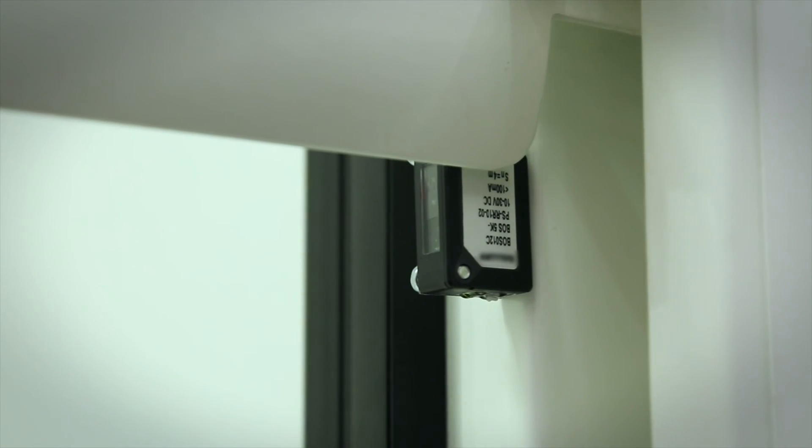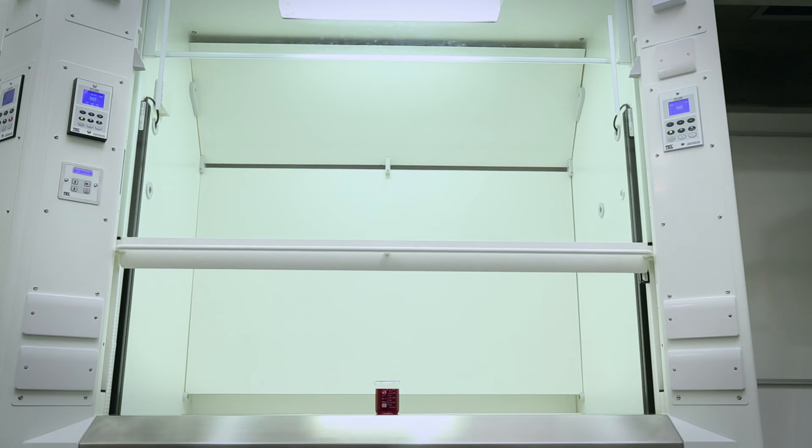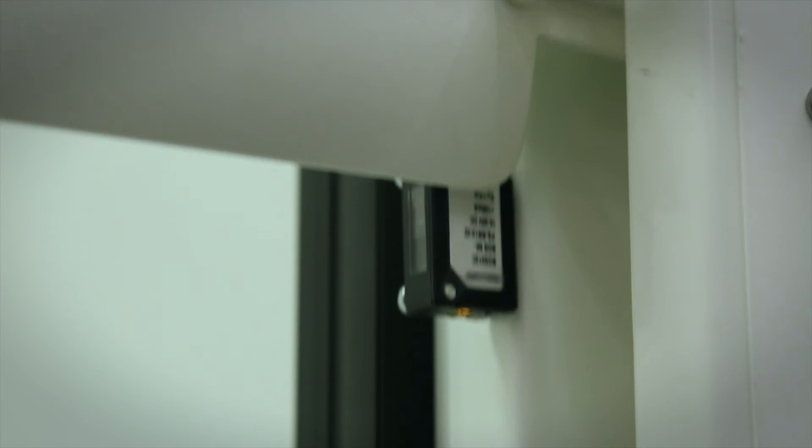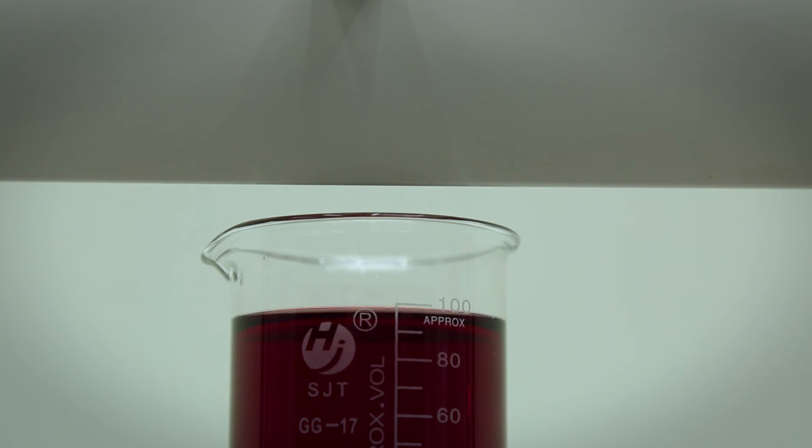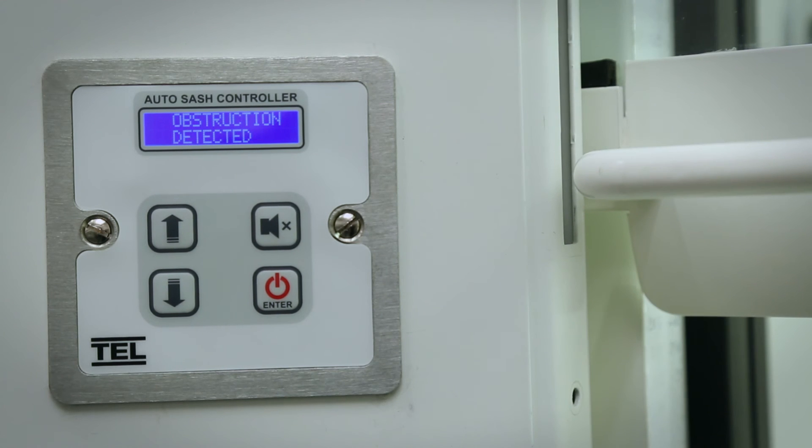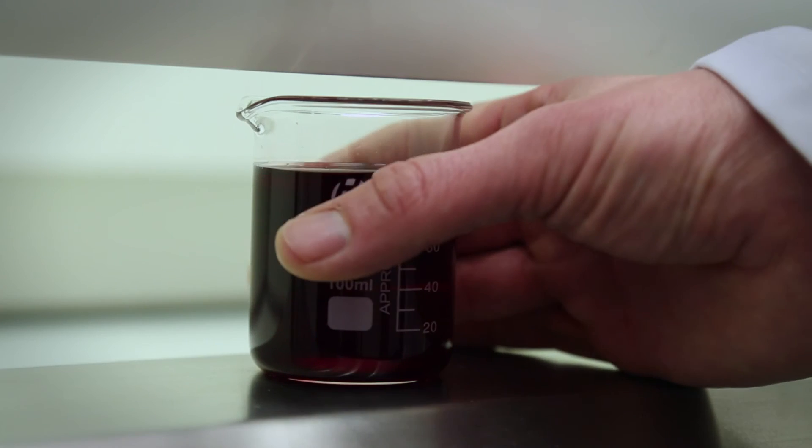The under sash sensor creates a single beam underneath the sash handle. If at any point during the closing sequence this beam is broken, the auto sash drive will be disabled and will give audible and visual alarms. Once removed, the auto sash will automatically reset.